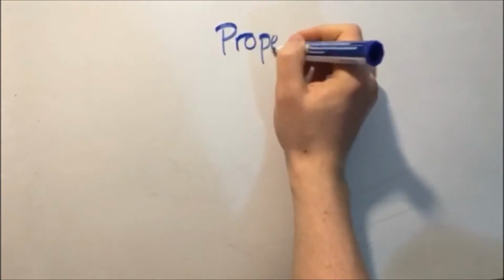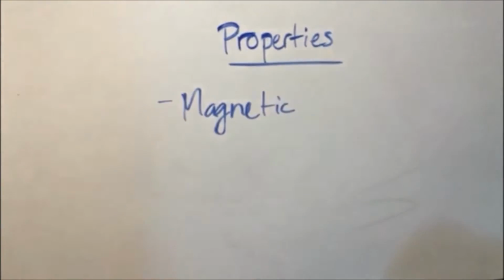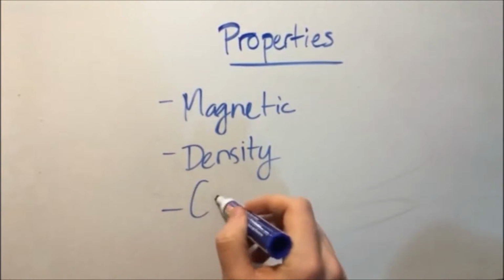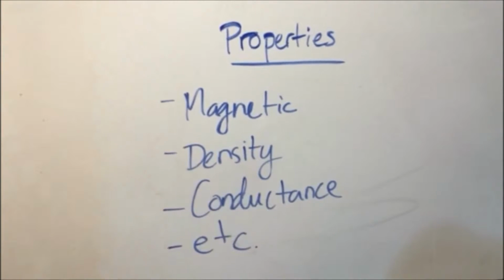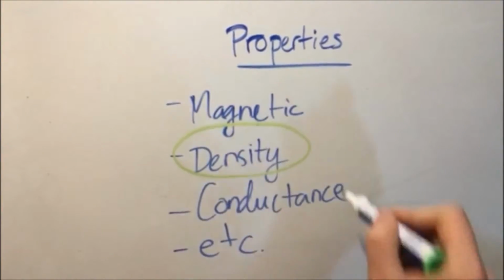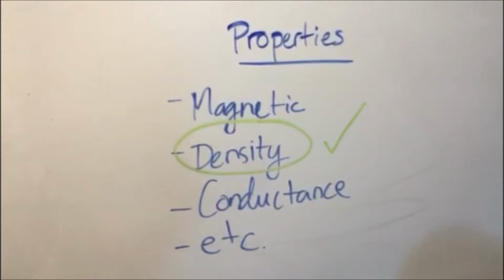When dealing with visualizations of objects at the nanoscale, there are a lot of ways to measure attributes of a sample in order to create an image. The goal of electron tomography is to create a 3D image that represents the actual physical shape of the object. If we're recording 2D projections of the object, then we just need to record an image that shows us the projected density of the object. In other words, the shading of a pixel in the image linearly corresponds to the amount of material in front of that pixel.